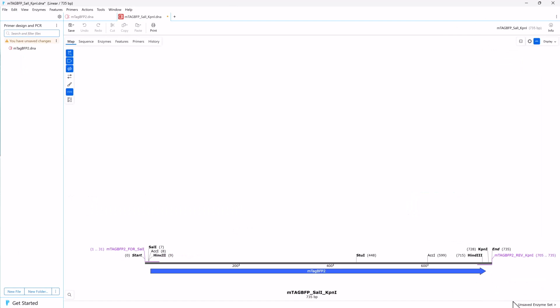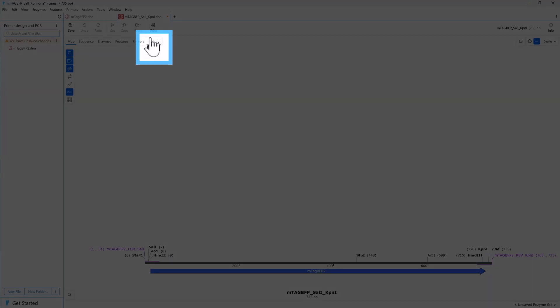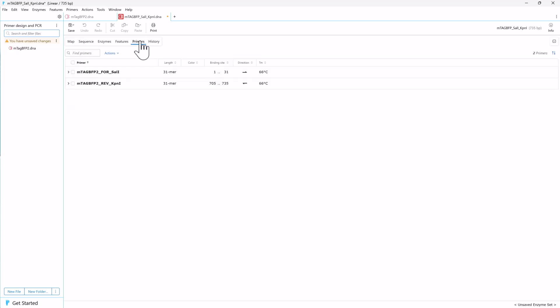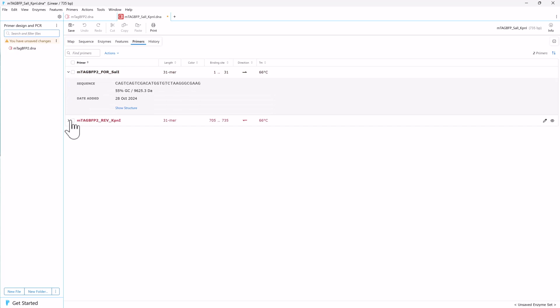The product file shows that the two restriction sites have been added to the sequence. Switch to History view to see a summary of the PCR steps. You can also switch to the Primers view to see the new primers. Expand the rows to see the sequence and other information.